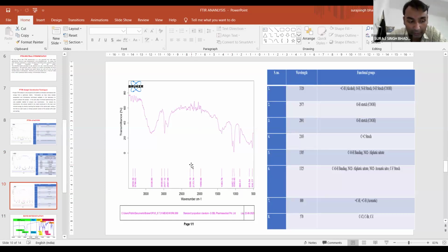Sometimes we procure different mother tinctures from the same pharmaceutical company. So generally it gives you the generalized idea. It prevents the biasness. So here it is the holistic approach. The result and the conclusion are generalized. So definitely we go for this type of standardization FTIR analysis for the same drug from different pharmaceutical companies.